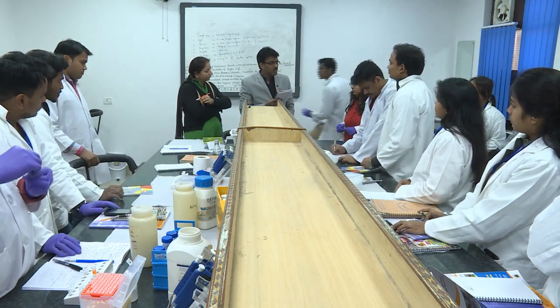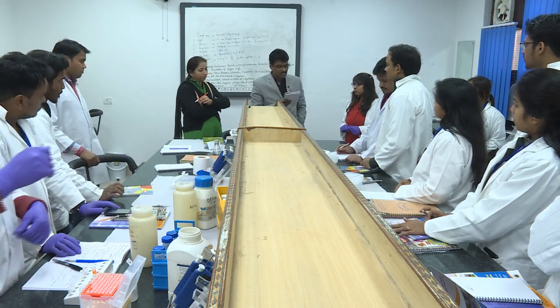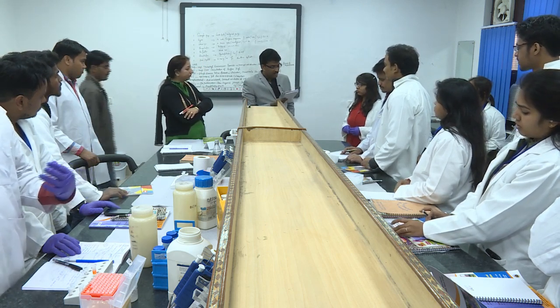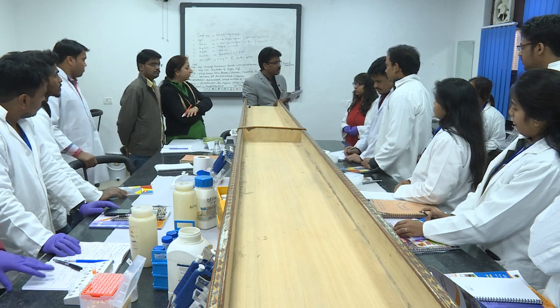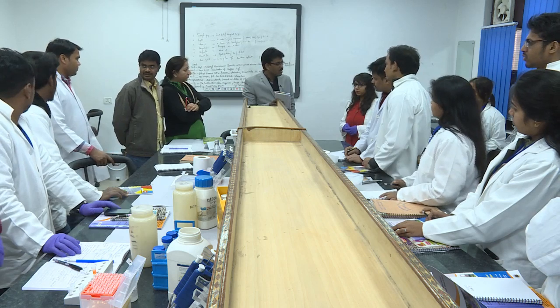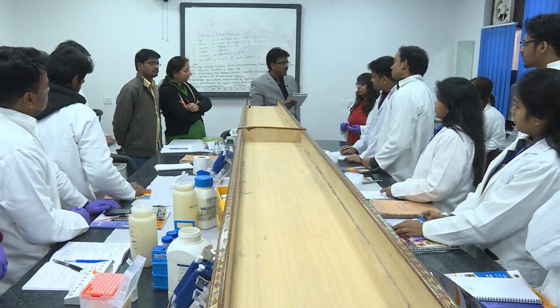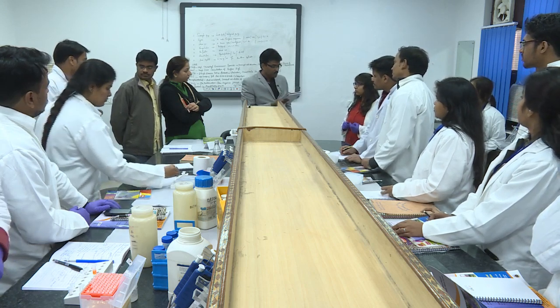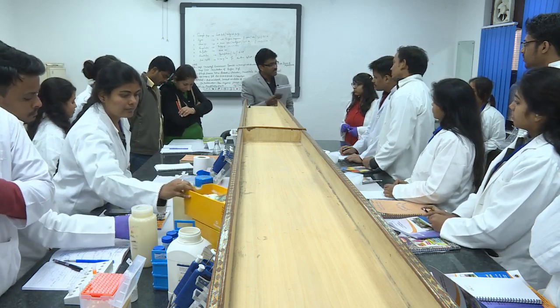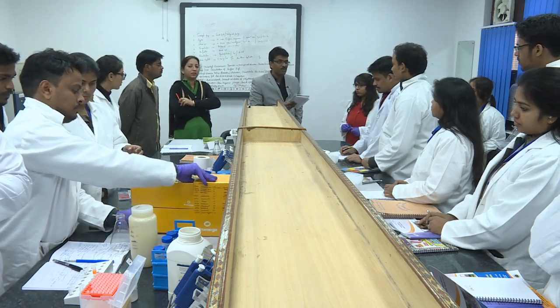So, what you need to do now is make a template DNA. This is the stock DNA. Now, you make a template DNA which has 100 nanograms per microliter. Okay. You just work it out. This is your stock, and you need to mix X quantity of the DNA, which is going to take out 200 nanograms, right, and you add the solvent, whatever you used.